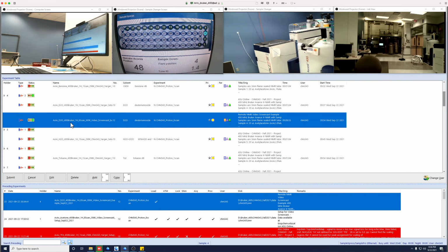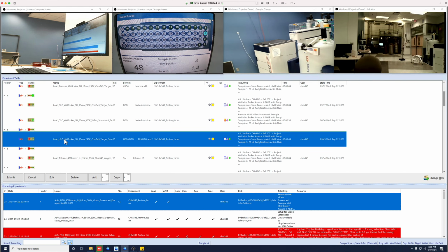And the common trick in NMR is in D2O, when you have exchangeable ones and they exchange for those deuterium and now they become proton NMR silent, is to put it in just a small amount of D2O so that it can still lock, but primarily H2O so that the exchange is with hydrogen and it would still be observable in the NMR.